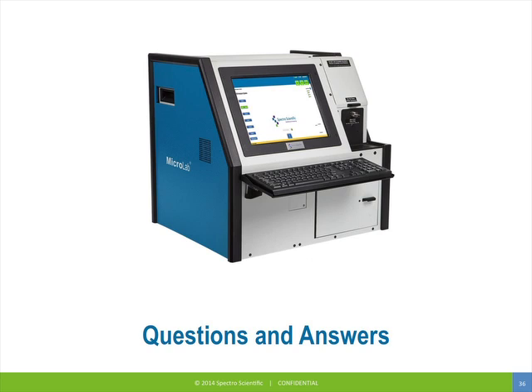Yeah, that's one of the programs we do quite often is getting a customer to give us all of their asset/component information, which sometimes is huge, and actually putting it into the MicroLab, which in turn processes it into LoopTrack itself. And it's a huge time saver when you're actually running samples to have all that data already pre-entered into there.